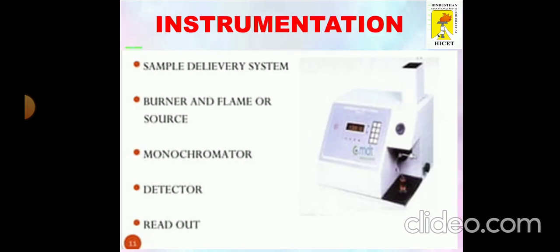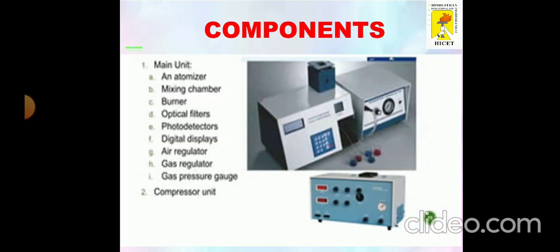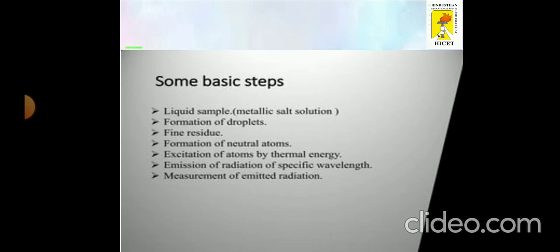Instrumentation. It has components of various systems like the sample delivery system, burner and flame or source, monochromator, detector and recorder. Instrumentation, diagrammatic representation, components. Some basic steps: liquid sample, that is the metallic salt solution, formation of droplets, fine residues, formation of metal atoms, excitation of the atoms by thermal energy, emission with a specific wavelength, and measurement of emitted radiation.